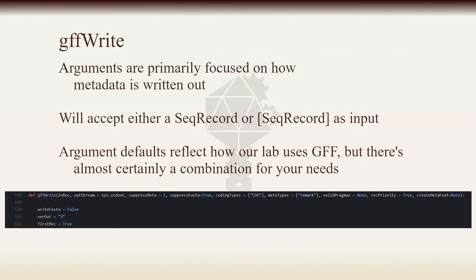In addition to the GFF SeqFeature object, we also offer GFFWrite and GFFParseIO functions. Like SeqIO, these operate on SeqRecord objects. Because GFF does not have as full-bodied a header as GenBank does, GFFWrite provides a variety of optional arguments for customizing the metadata output at the record level. Our lab tends to strip as much of this as possible, which is reflected in the default arguments for GFFWrite, but users should be able to use it to preserve or add data to their headers as they like.